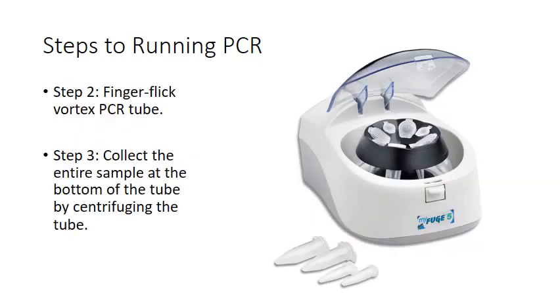The next thing you want to do, once you have your concoction in your PCR tube, is agitate it a little bit. You want to mix it up so that all the components are inside the tube and evenly distributed throughout the tube. To do that, we're going to use a really fancy technique called the finger flick, the finger flick vortex.